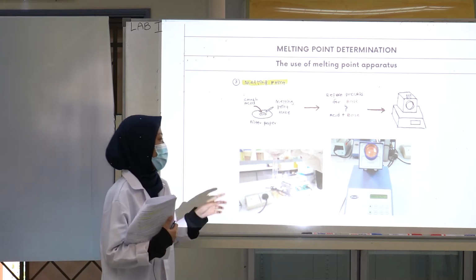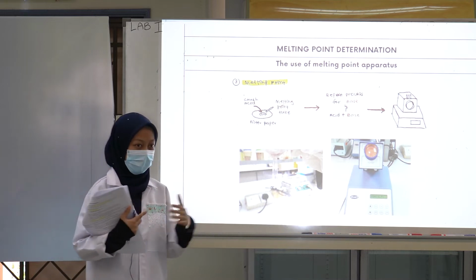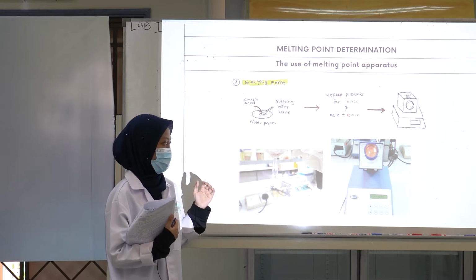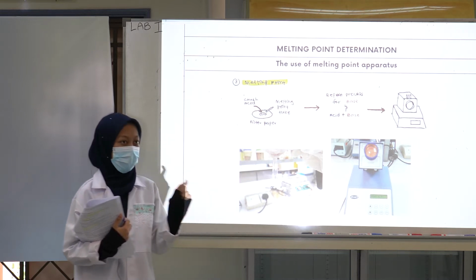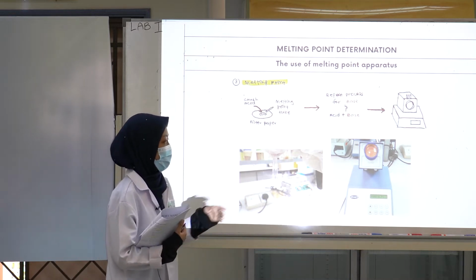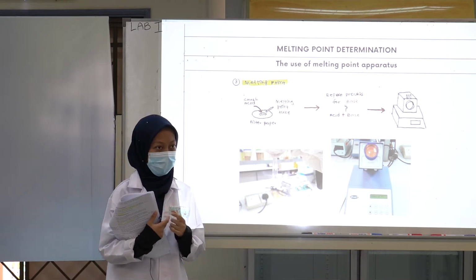After that, it will be heating, and in the heating stage, you need to always observe carefully. Observe when the organic solid starts to melt first, and when it has completely melted.